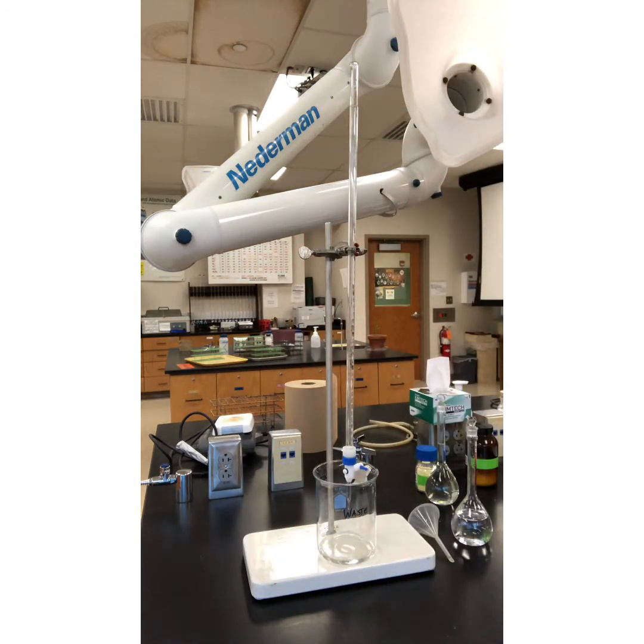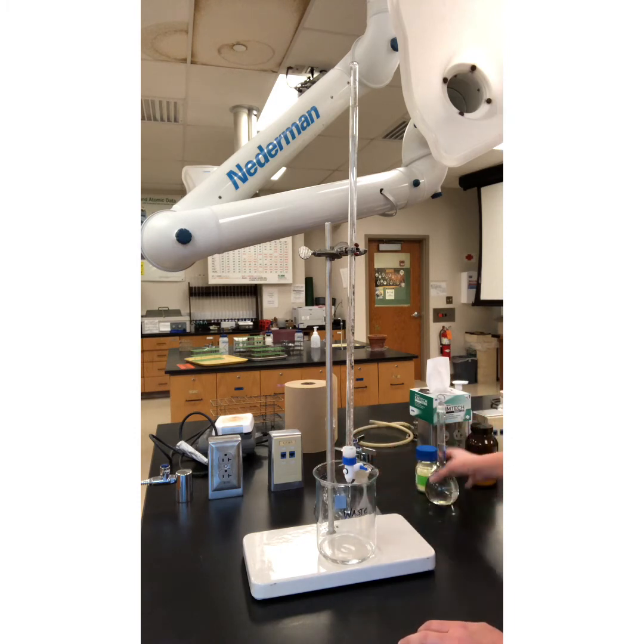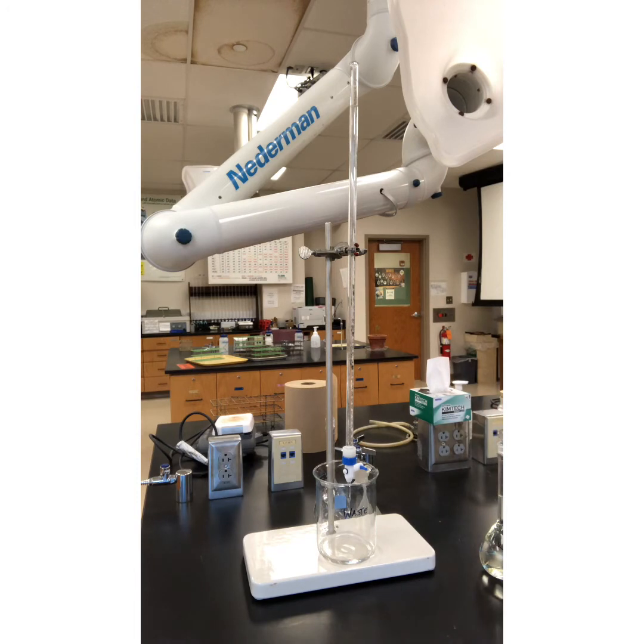Okay, so part D, titrating the potassium ferrocyanide with our zinc sulfate solution. Okay, it's more volumetric glassware.